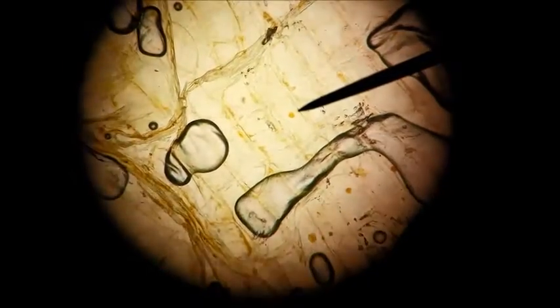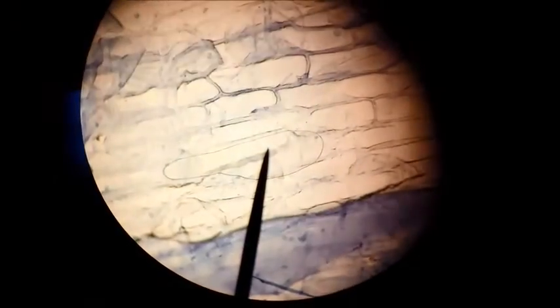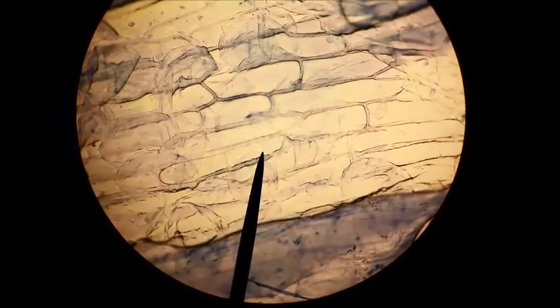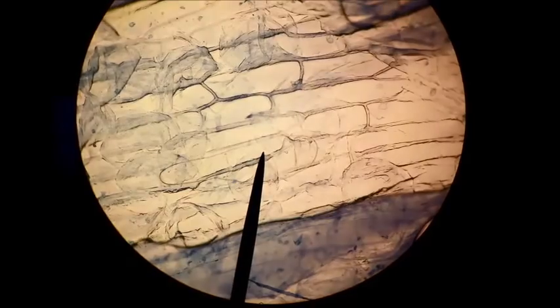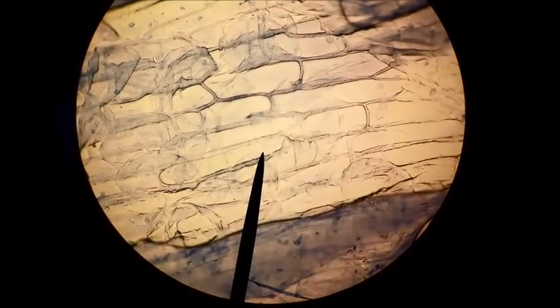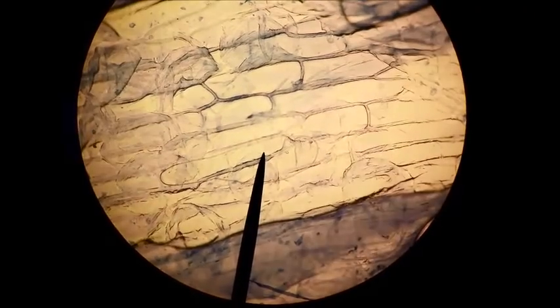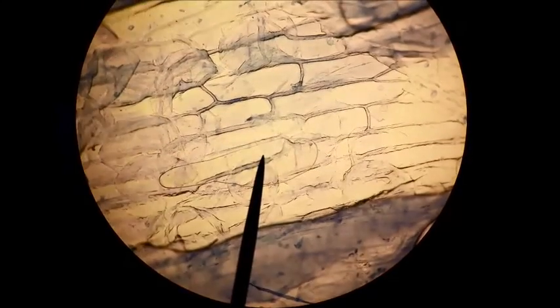Okay, this is a Janus green stain. This is Janus green and probably the chief thing that we can see are the cell walls, the cellulose cell walls of the onions here. And it seems like the longer we've been sitting here, the more of these have been soaking up the dye. You can't really see a lot of nuclei in this, but you can easily see the cell walls.